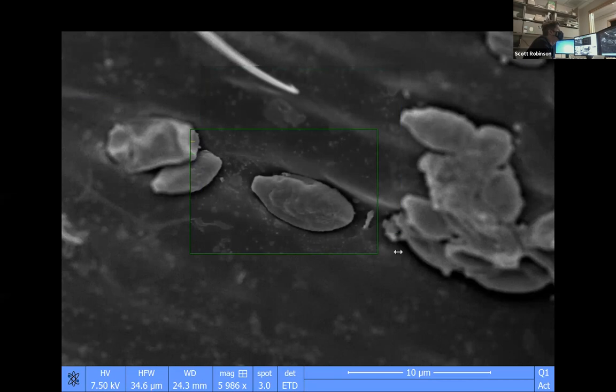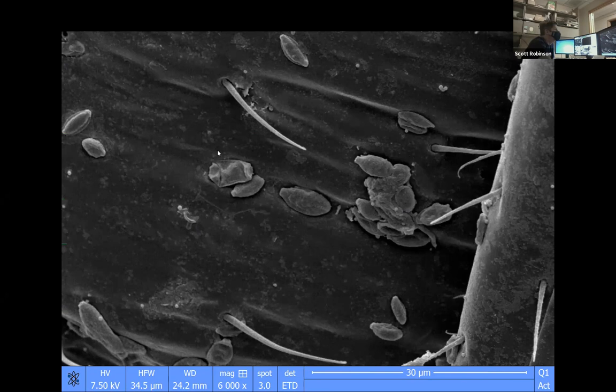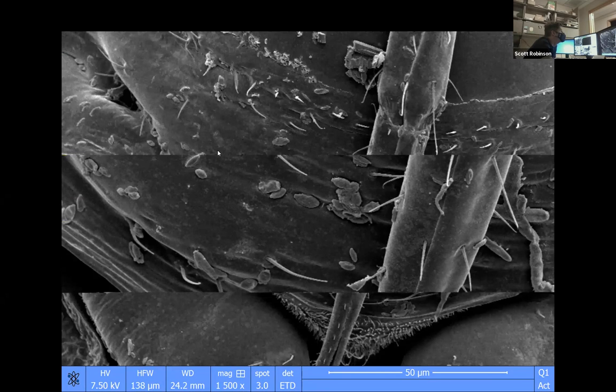I'm not sure what these are. They look like mold spores. I think that they're probably mold spores. They don't look like they're bigger than bacteria, generally bigger than bacteria. I'm not sure what we're looking at. You can see some little crystals right here too.